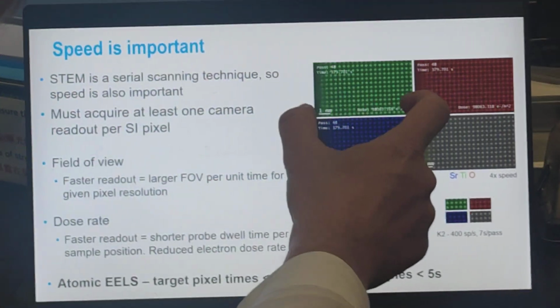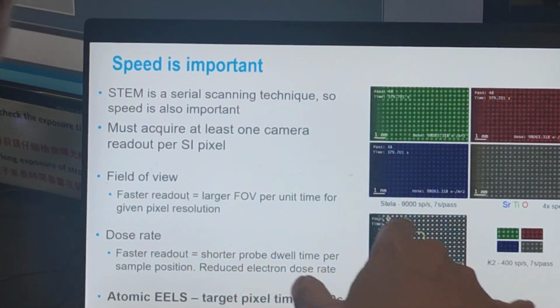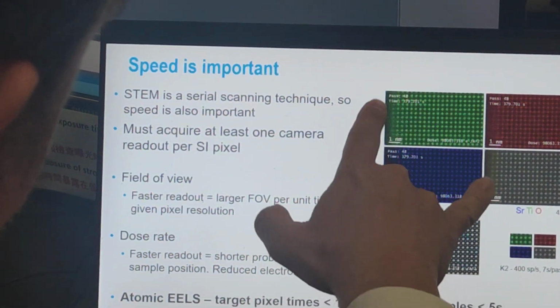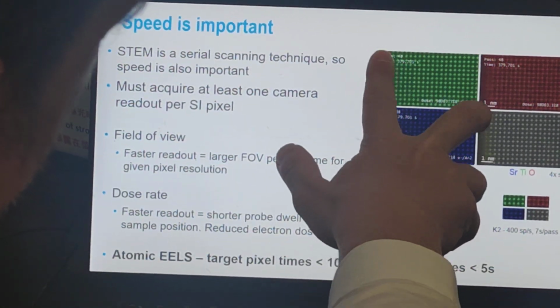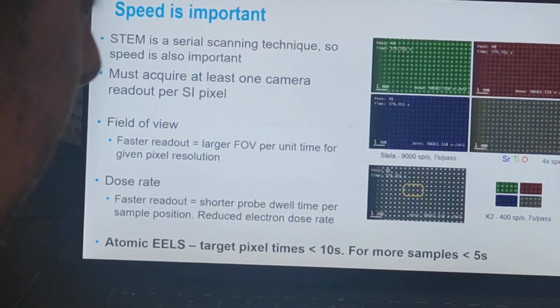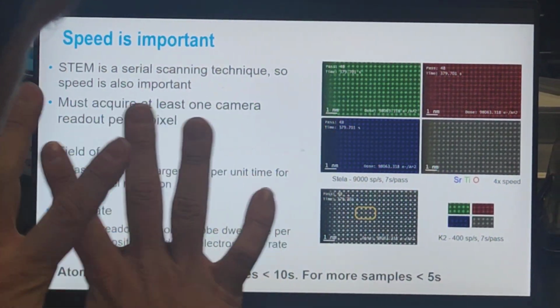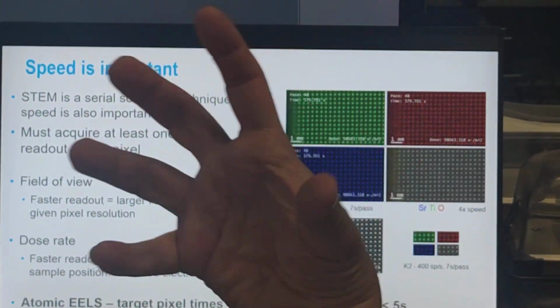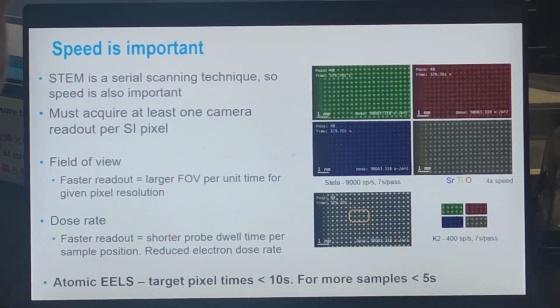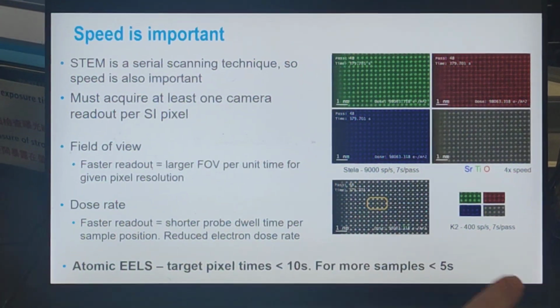So basically if you can scan, at least on our microscope, your microscope will be even better. So in our room, if you can get one of these in less than 10 seconds, less than 5, then the drift rate frame to frame is usually less than the atomic column, and the drift correction works. And as soon as you're not getting these kind of erratic shifts, you can acquire for quite a long time.